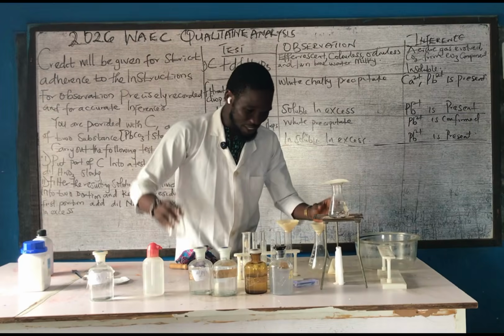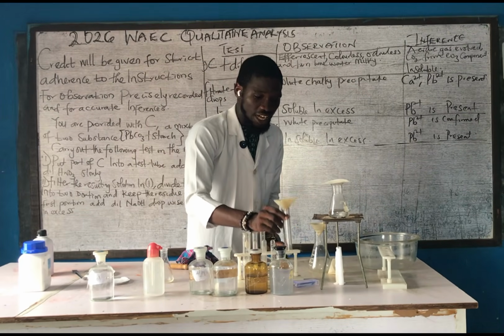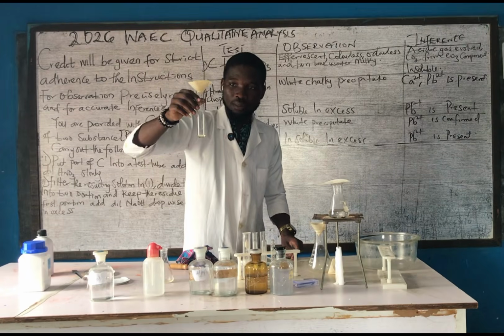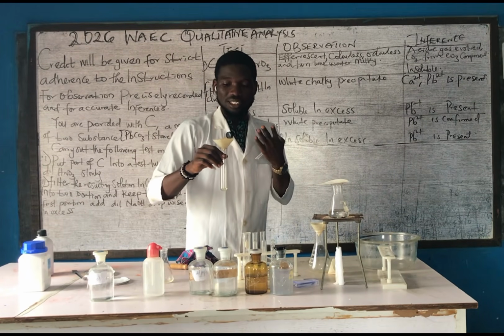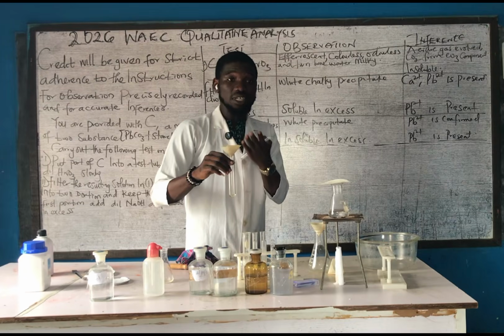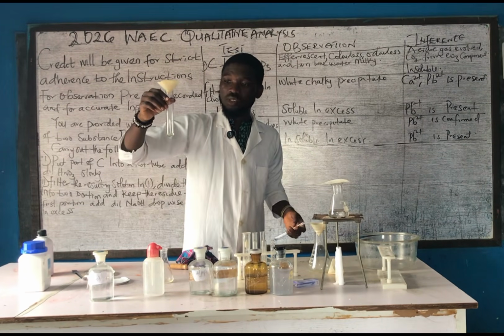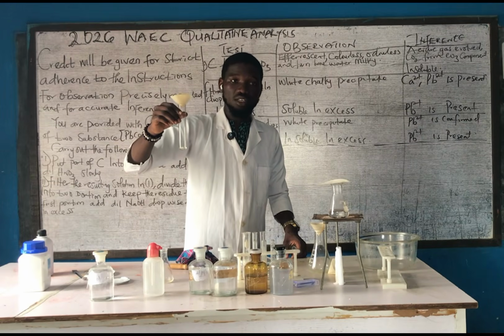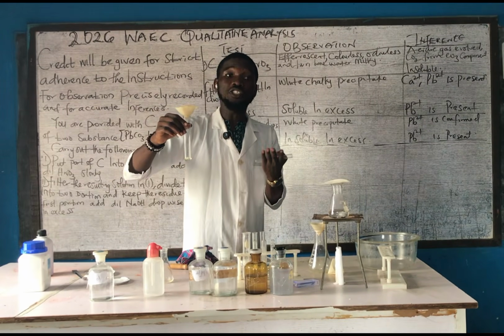This is my filtrate. Please, as a teacher out there, this takes time. So I will advise you to separate the filtrate and the residue for your students before the examination, because this will take time for the filtrate to undergo what we call filtration.